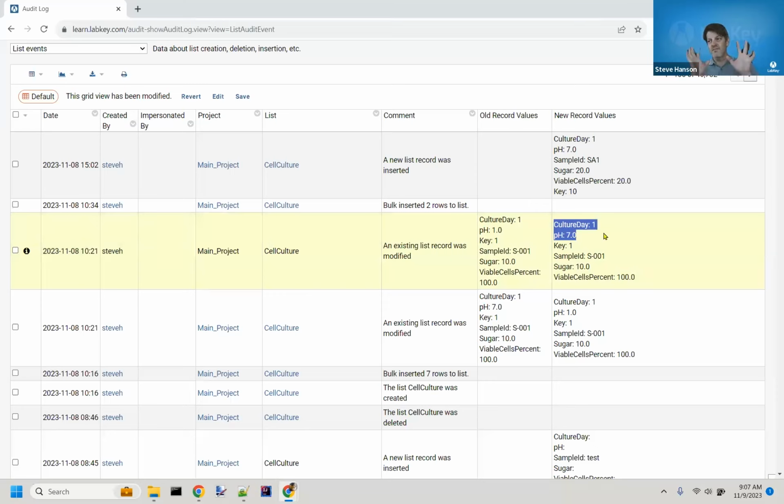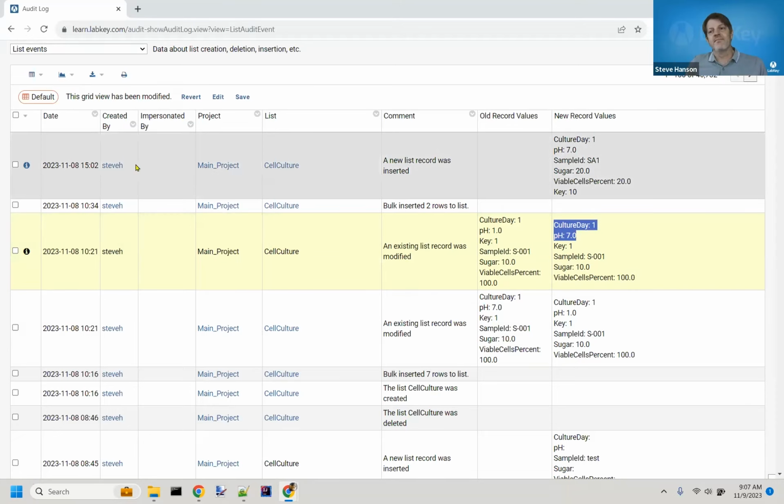I hope this really makes it vivid for you how detailed the audit log is. Basically everything is captured. 46,000 rows in just this facet. In any case, that's all I really wanted to show on that.